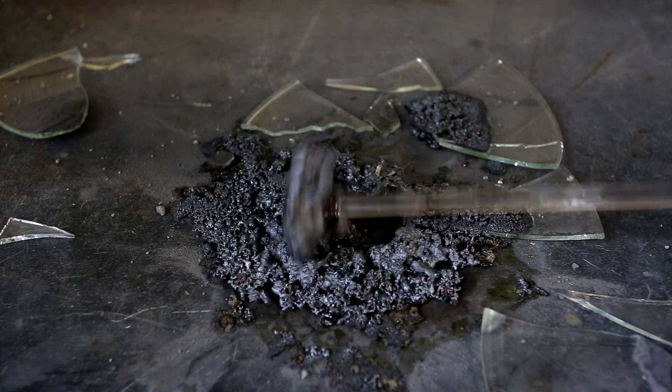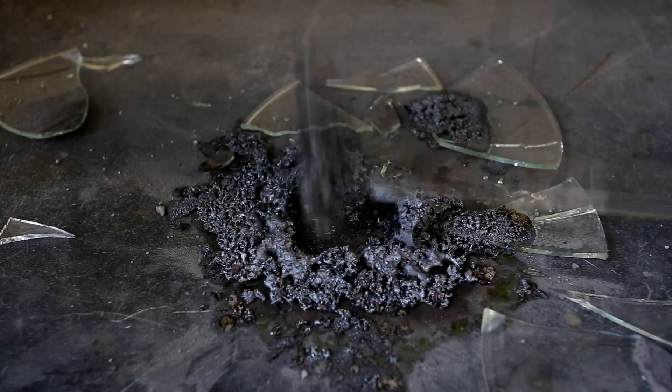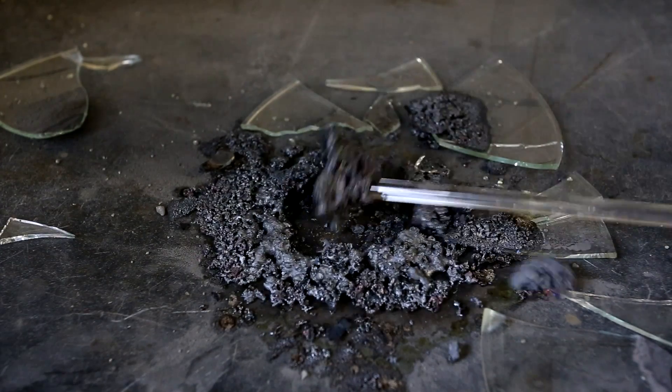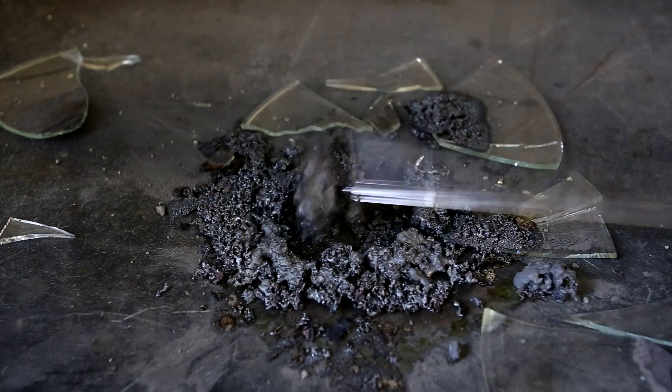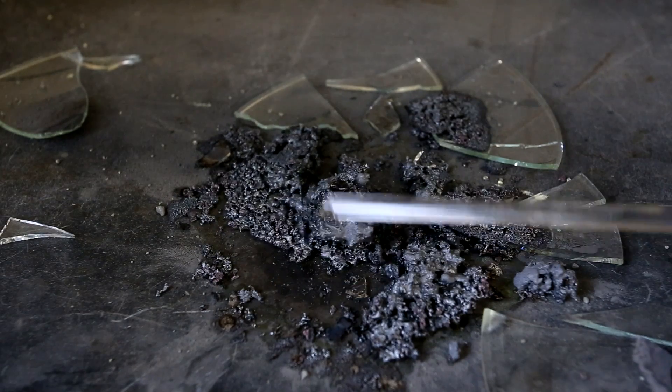If you are interested in keeping the iron(II) sulfide, then you can wait till it cools, break it up, and put it into a container. Just as a warning, powdered iron(II) sulfide is pyrophoric, which means that you probably shouldn't powderize it, as it might ignite on contact with air.